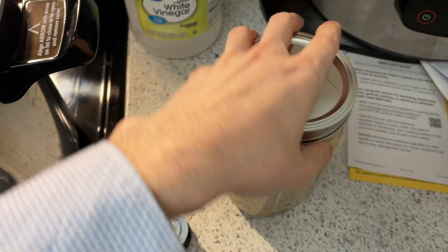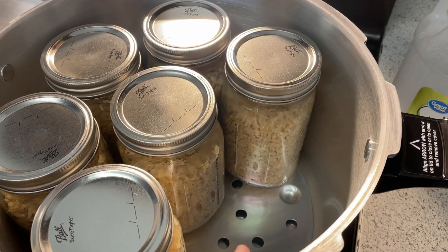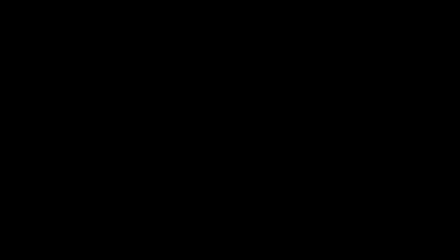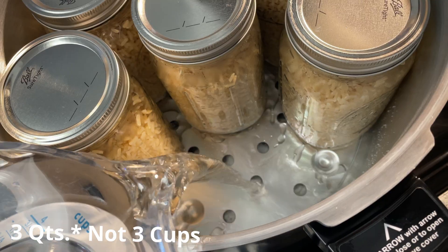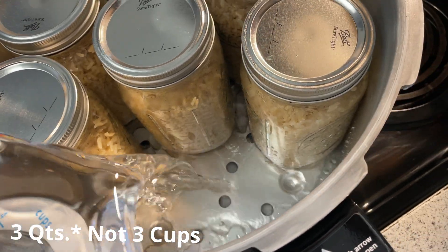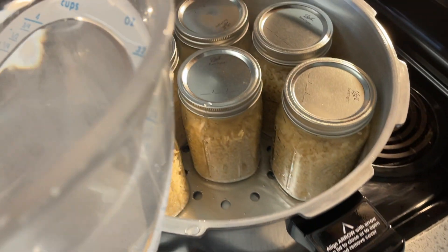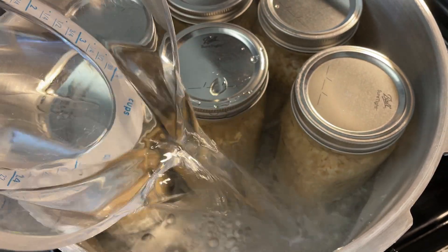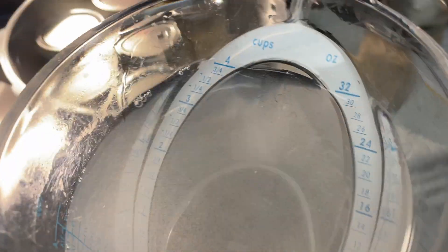Make sure to use white vinegar as it will prevent any clouding on the outside of the jars. Now we are throwing our cups of water in. Presto says three cups of water no matter how much you pressure cook, so I would always recommend to go with the owner's manual on this one, as you don't want to break any jars and you don't want your pressure cooker turning into a bomb.